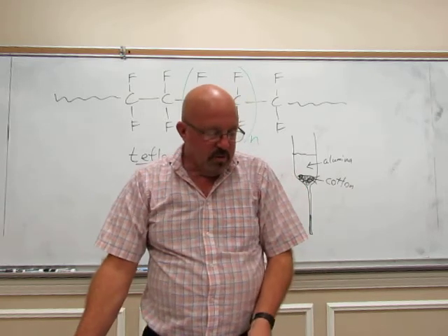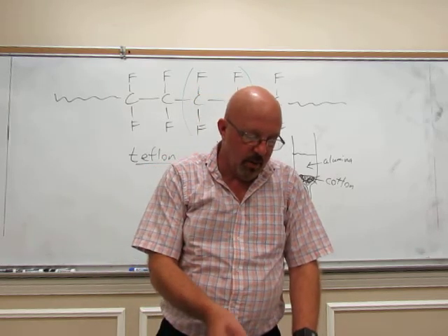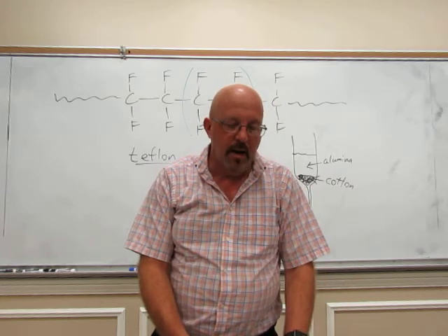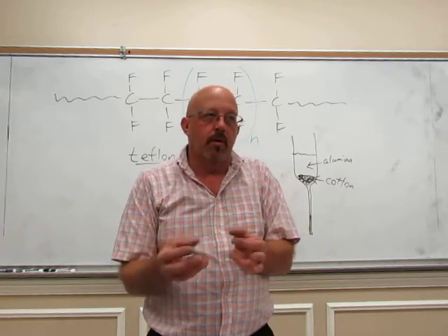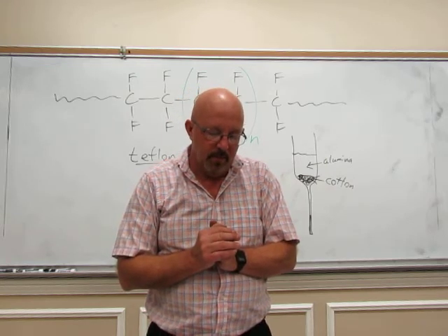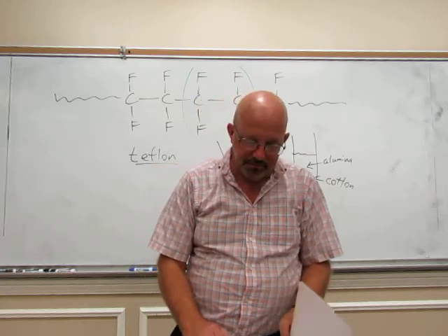In your conclusions, discuss the texture of the polymer. Is it hard, brittle, sticky? If it's sticky, it means that you didn't heat it long enough, didn't cook it long enough. If it's extremely brittle, breaks very easily, it means you overcooked it, cooked it too long, heated it too long. So you can talk about that in your conclusions.